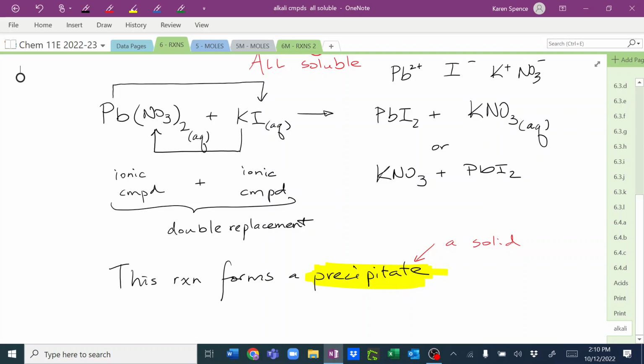Yeah. Okay. All right. So now hopefully it's been for long enough. You're not supposed to do this, but I kind of always do. Okay. This obviously is the one that didn't have anything in it. And now, can you see how it's all ended up on the side and at the bottom? Okay, so we've actually managed to separate the liquid from the solid.